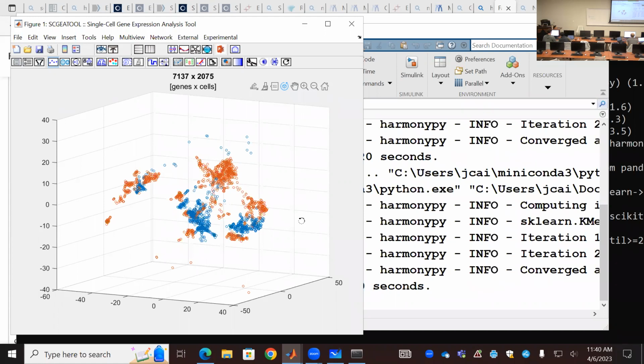This is from the beginning. Oh, you use a different embedding. Yes. So you start from a t-SNE. We start from slightly different. We start from, if you click this, you get better. Oh, you use the old version, so you haven't updated. You use an older version of the toolbox. But it's the same idea, okay? Yeah, same idea.